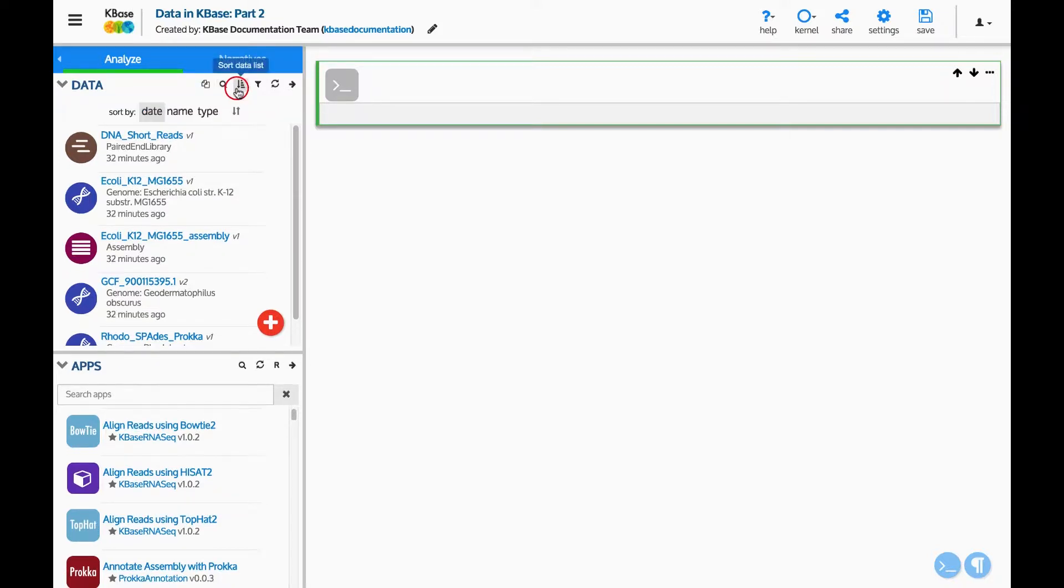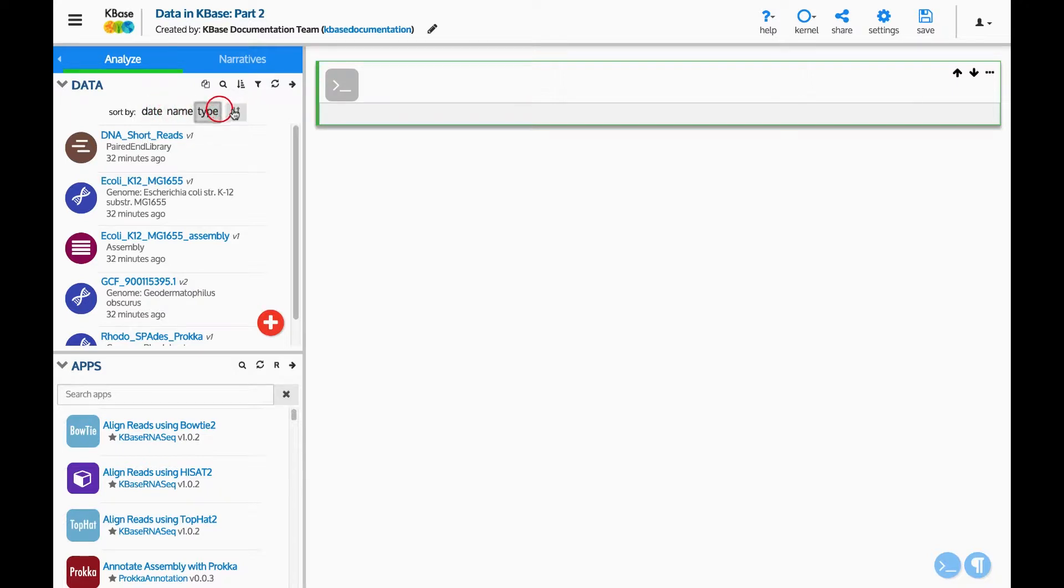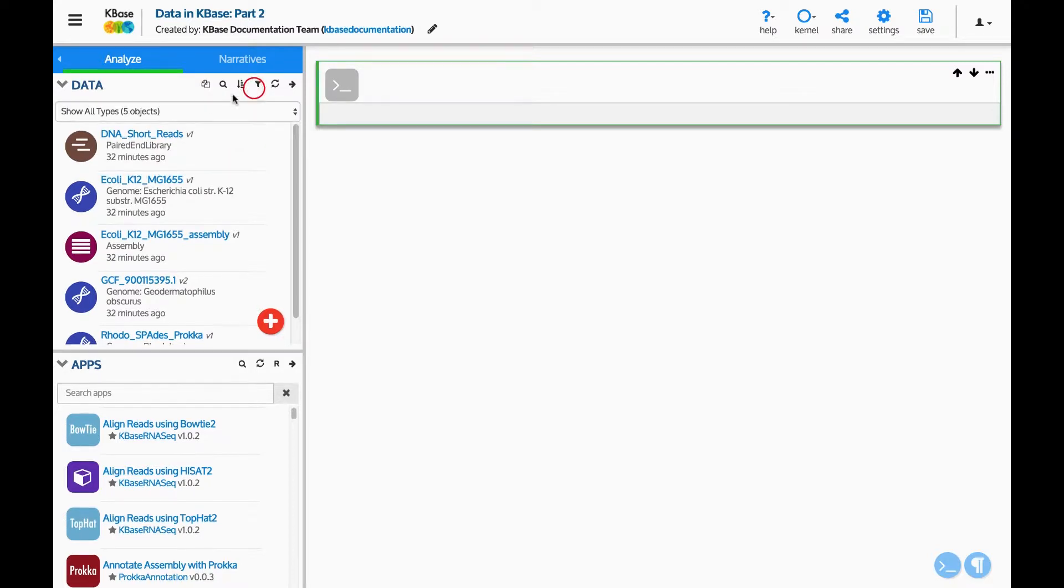Pressing the sort button changes the order of the list results. We can sort the data by date created, name, or type of data in ascending or descending order. The data can also be filtered by type.